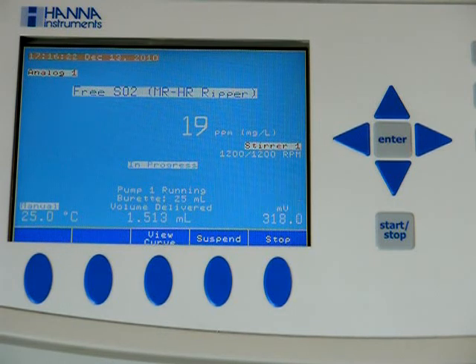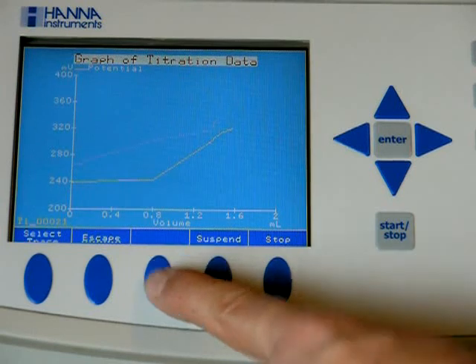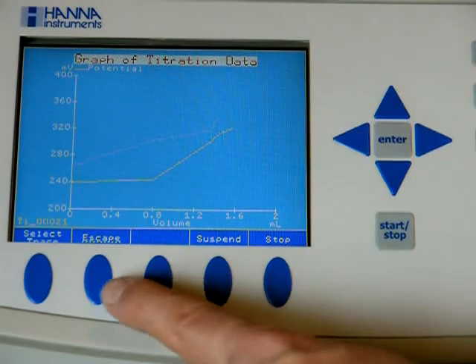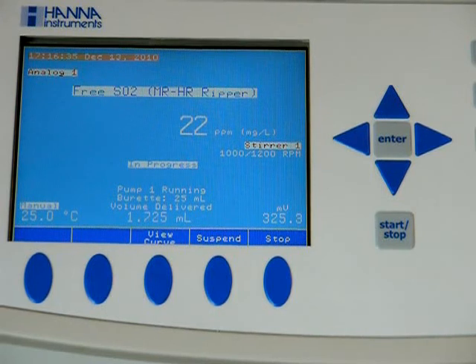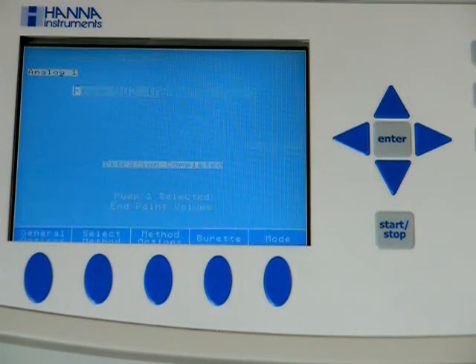We're starting to deliver smaller doses as we're getting closer to the end point. Let's see the curve again — we'll see the titration is about finished.